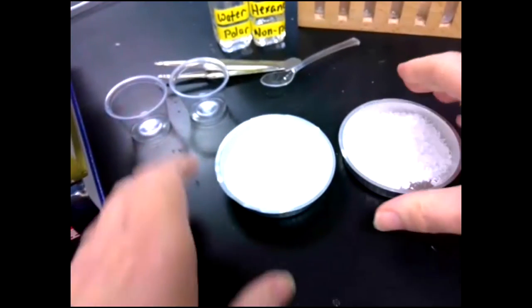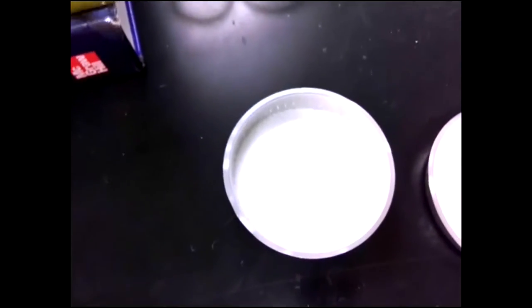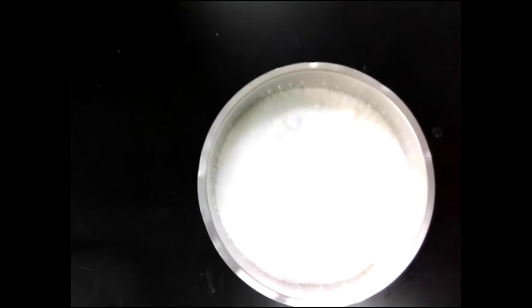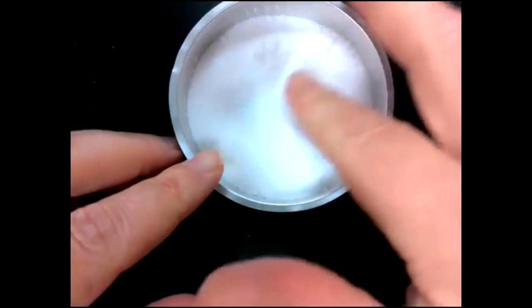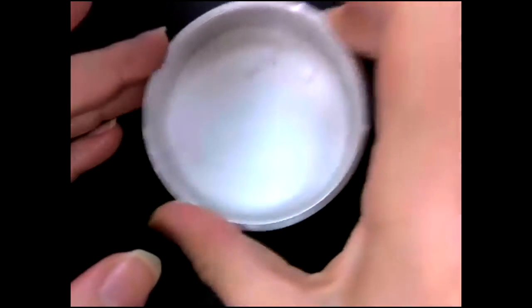So here's the two solids. I don't know if it's very bright in here, so you can kind of see. And again, I didn't label them, but this is A. So you can see it in the shadow. It's like the light shines off of it. It's hard to tell. And it's safe to touch, so I'll just touch it. It's a white solid. It kind of looks like sugar. It's not sugar.